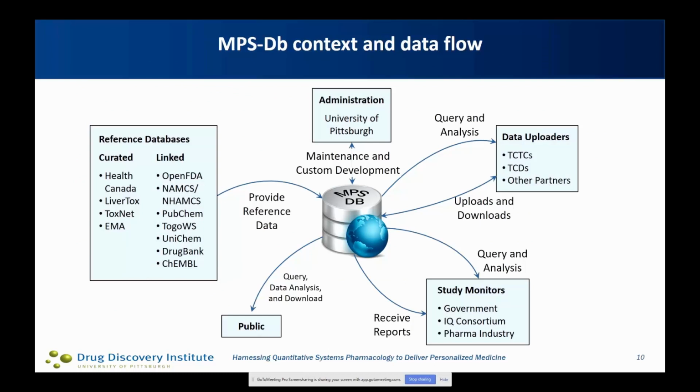So this is a conceptual drawing of the interactions and the context of the Microphysiology Database. It's a web-based database. It's administered and hosted here at the University of Pittsburgh. We've been doing all of the development on the database, although the development of the database is managed in a GitHub repository, so others could participate in that development.